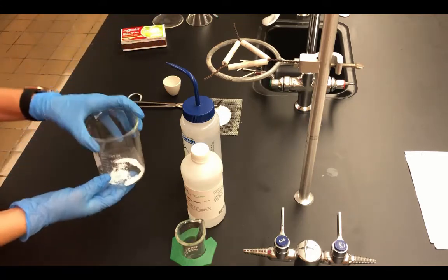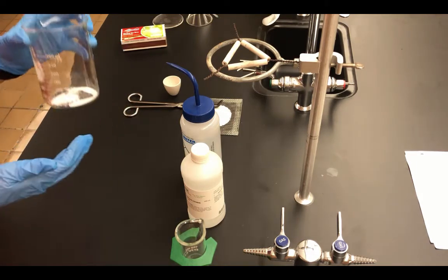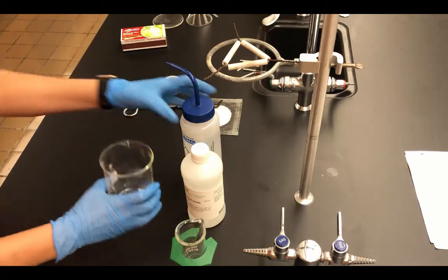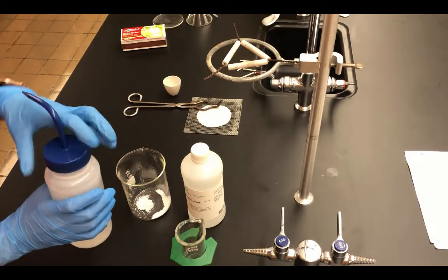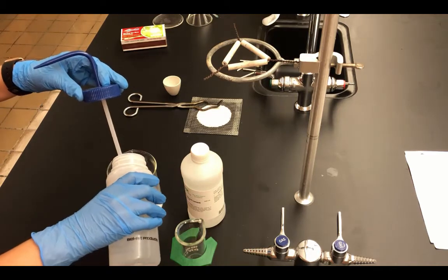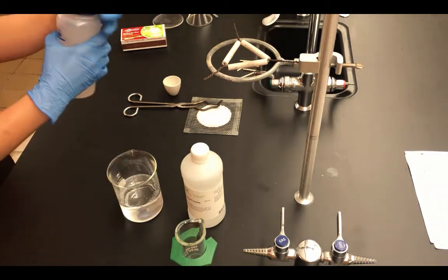So we have the 400 milliliter beaker, and it says add about 200 milliliters of distilled water to the beaker. Since we're not looking at exact amounts of distilled water, it just says about 200 milliliters, we can just use the markings on the beaker. Normally we use a graduated cylinder to measure precise amounts, but since we just want to dissolve the substance into water, I'm just going to pour up to about the 200 milliliter mark on the beaker.